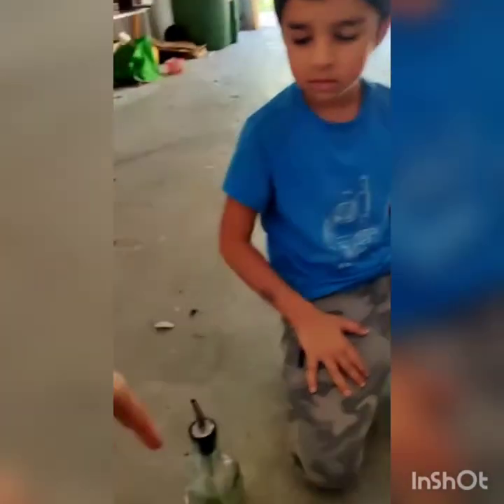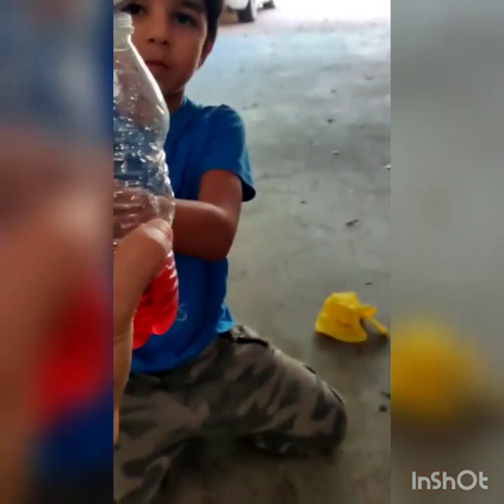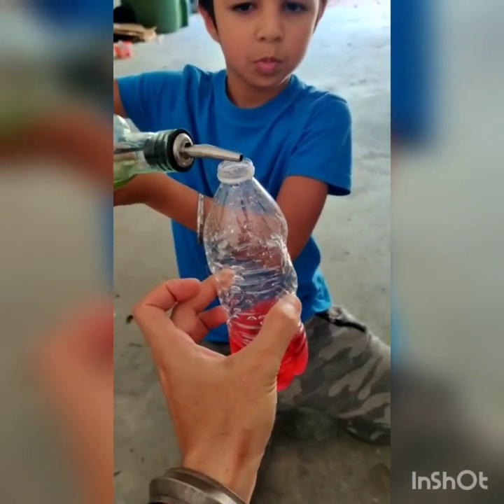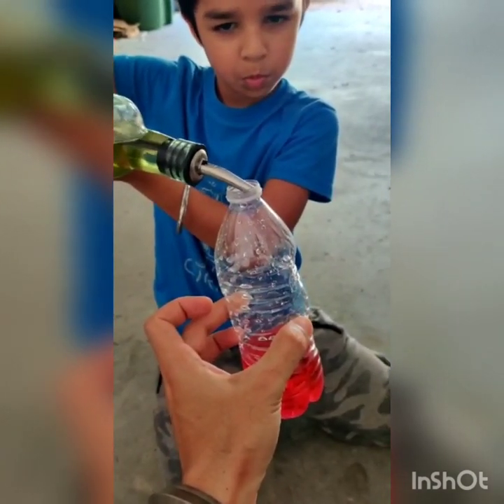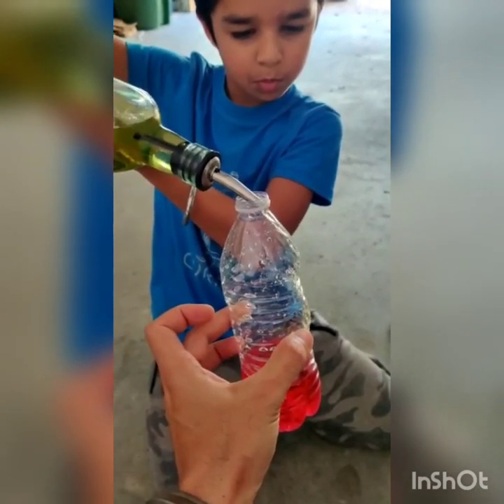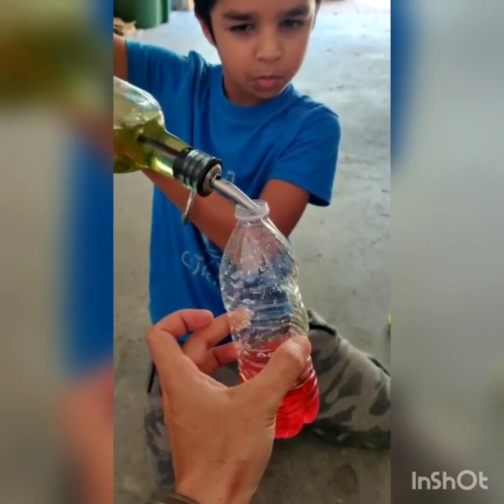We take oil. Take the oil. And put it till it's a little more than half. Okay, this is half, so a little above my thumb. All right, but carefully put it. Now you have a nice spout to pour it with, so it won't fall. Make sure it's always pointed into the bottle. Perfect. Good. Okay, keep going.